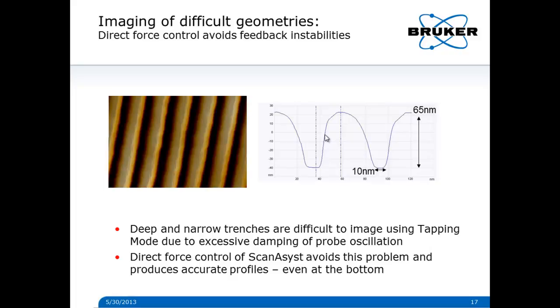However, with PeakForce Tapping, we feedback on the peak force, so that's always constant throughout the entire profile, and so that allows you to get into the bottom as long as your tip geometry will allow you to go in there. And you can actually see the difference. There's some variation in the bottom of these trenches in terms of the exact shape of that bottom, so we can actually get a good profile down there.